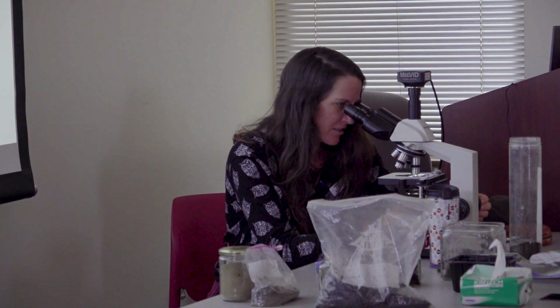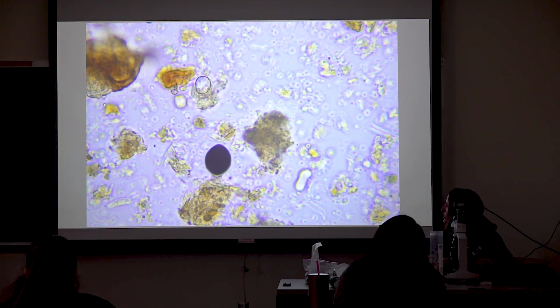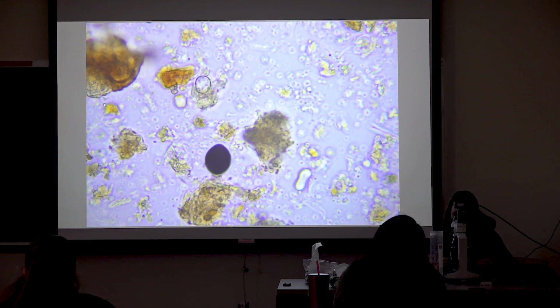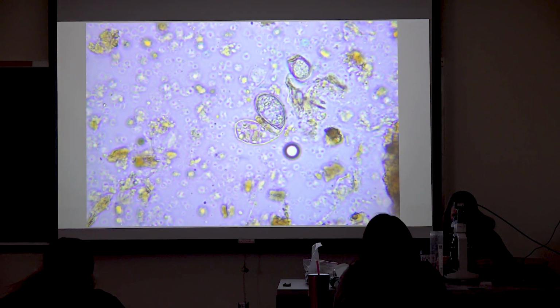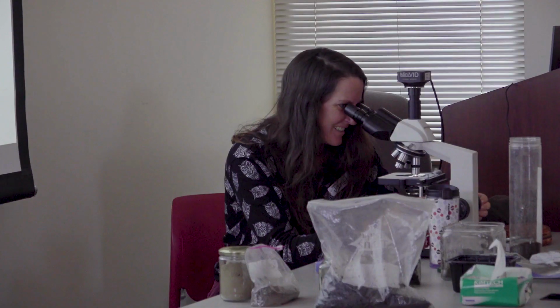So I want to find a better one, this one is particularly dark. So mushroom spores, fungal spores, this little seed-shaped thing, it's hard to tell on this screen, but it's actually very dark brown, and that is an indication of a fungal spore. I'm trying to find a slightly more see-through one. Tons of amoeba, just lots. And lots of different shapes of them too.